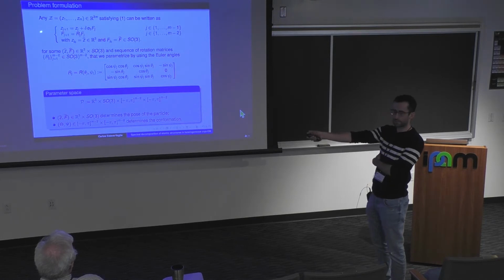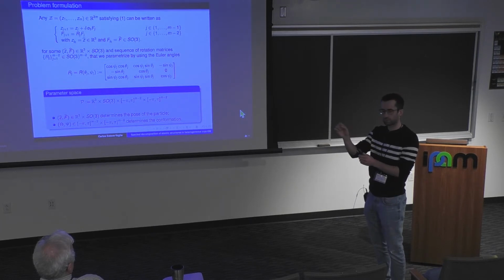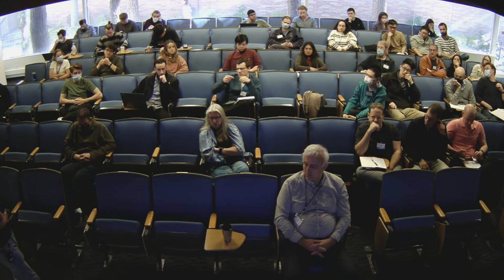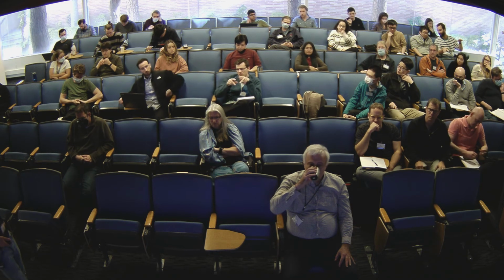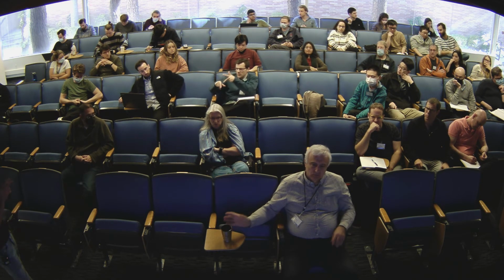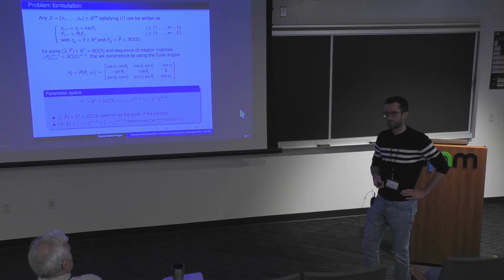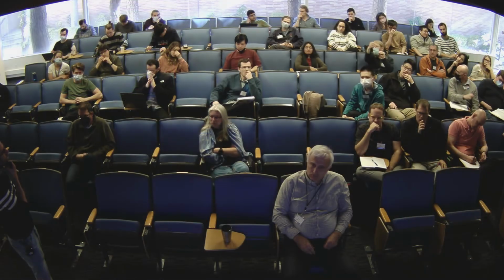Yeah. So the global particle is written as a discrete dynamical system like this. It's a discrete curve, and you can write it down using the position of one of the atoms and the orientation of the curve in this specific atom. And from this, you use these rotation matrices to construct the rest of the curve. So the curve is between residues for one. Yeah. So it's between C alpha positions. Okay. Yeah. So RJ would be that frame of each atom. Yeah, the transition matrix. It's not the frame, it's the transition. Okay. Yeah. And the delta you assume to be constant, right? Yeah. There's no stretch between. No, I assume it to be constant.